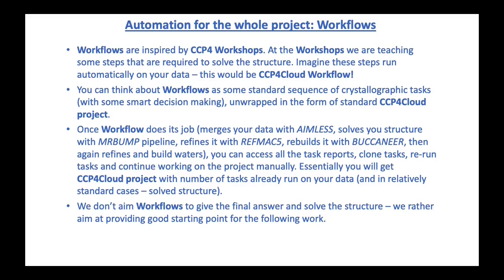You can think about a workflow as some standard sequence of crystallographic tasks with some smart decision making in between. And this sequence of tasks is unwrapped in the form of a standard CCP4 Cloud project and tasks tree. And once the workflow does its job, you can access all the task reports, clone tasks, rerun tasks, just continue working on the project manually. Essentially, you will get a CCP4 Cloud project with a number of tasks already run on your data.